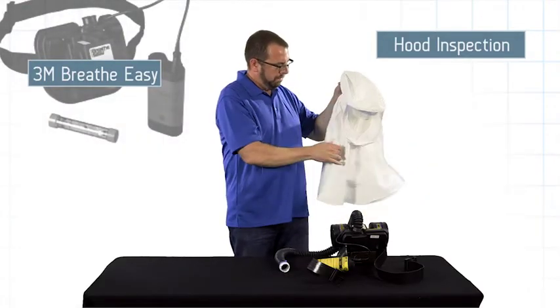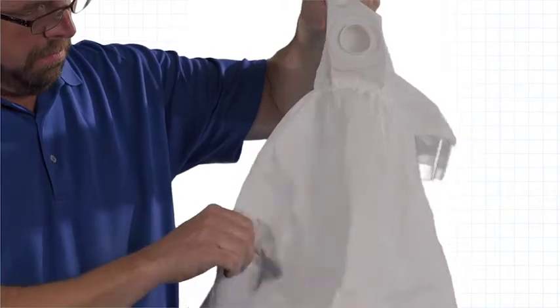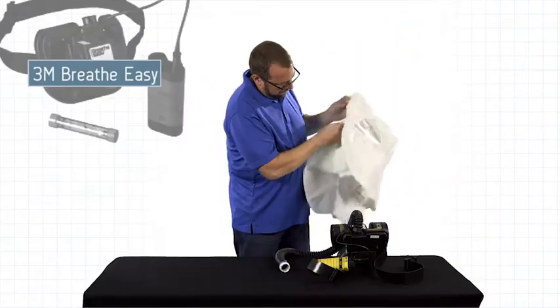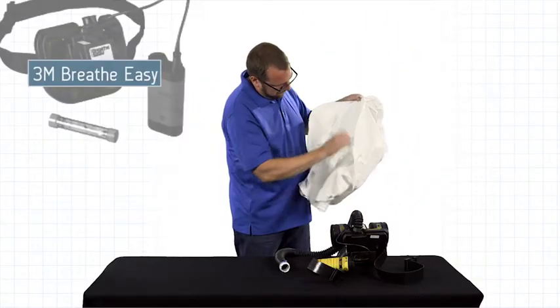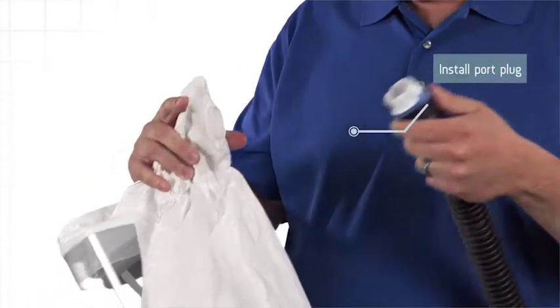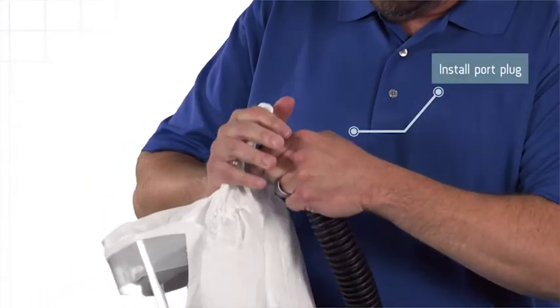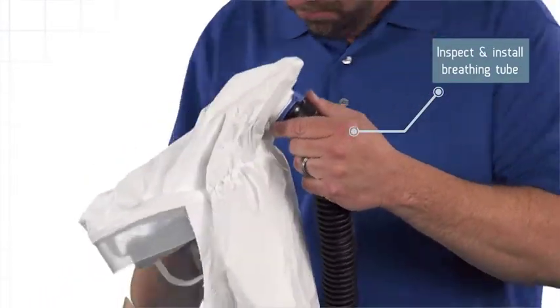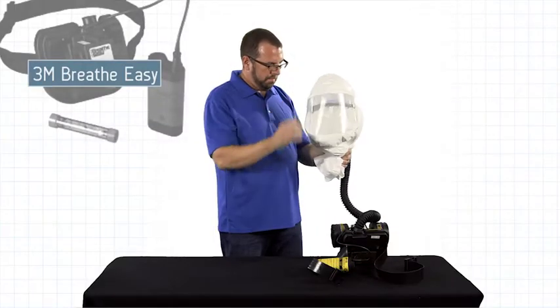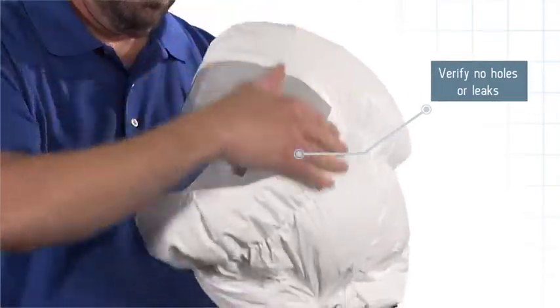Inspect the hood for any physical damage. Connect the hood to the breathing tube by snapping the breathing tube into the back of the hood. Squeeze the neck and inflate to verify there are no holes or leaks.